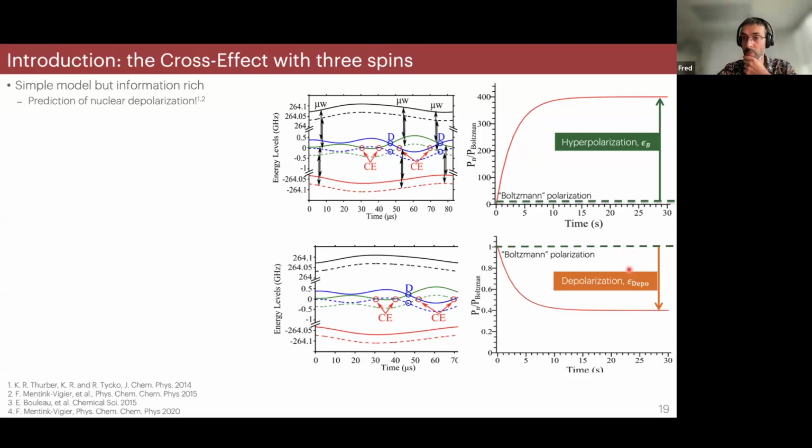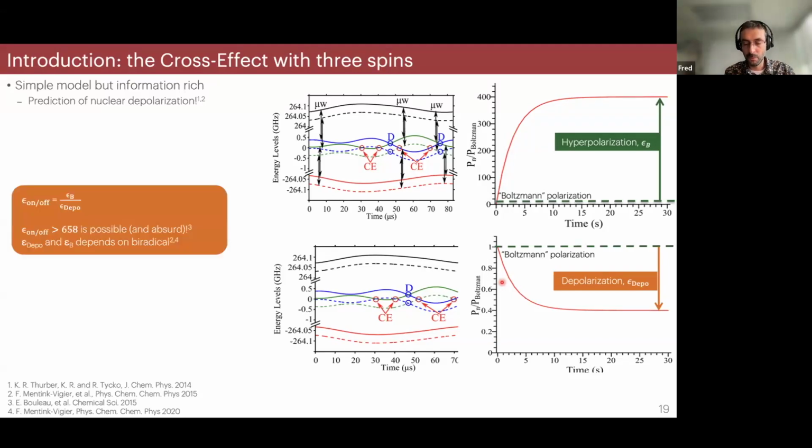It's a reversible mechanism. It should not be really confused with a paramagnetic bleaching. This is really something else. This is reversible. This is only with cross effect. And basically it has an impact, which is when we measure an enhancement, which is the ratio between microwave on and microwave off, and we do this with biradicals, we are not really quantifying how much we are gaining, and we can obtain absurd results.